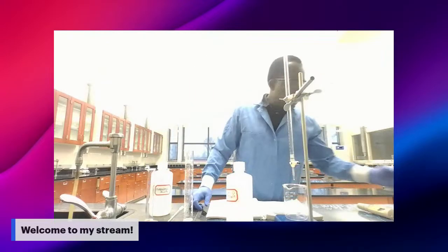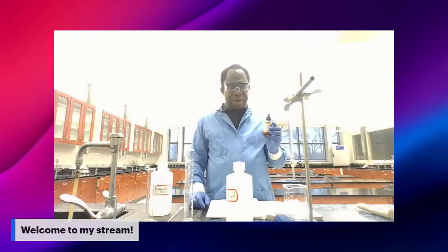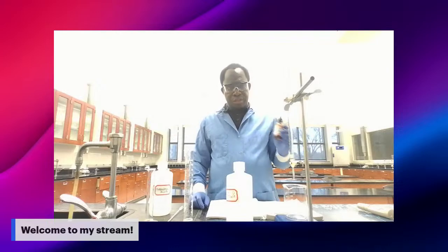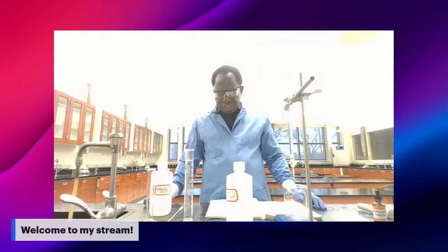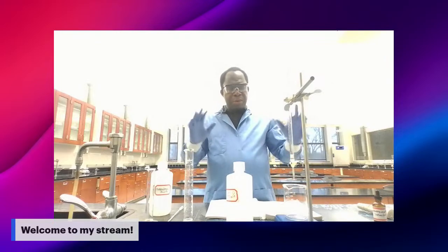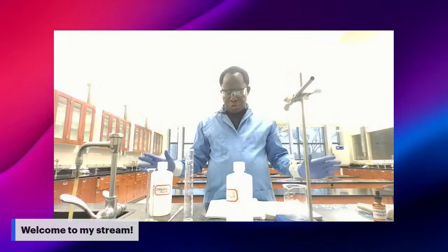You also need phenolphthalein indicator. This will tell you when you get to the equivalence point with the color change of your solution. Make sure you have the same setup and the tools you need.